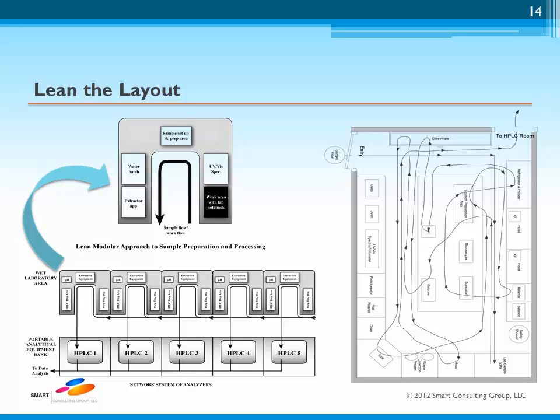In the lean laboratory then, the emphasis is on the reduction of travel time by keeping the processing and analysis areas close together and by creating a logical flow that is both manageable and even by employing standard work practices. Experience demonstrates that between 40 and 70% of sample time may be reduced by employing a lean laboratory layout that minimizes travel periods.